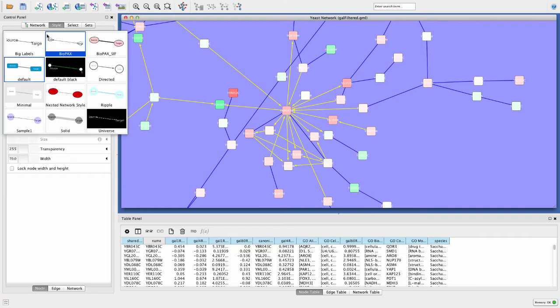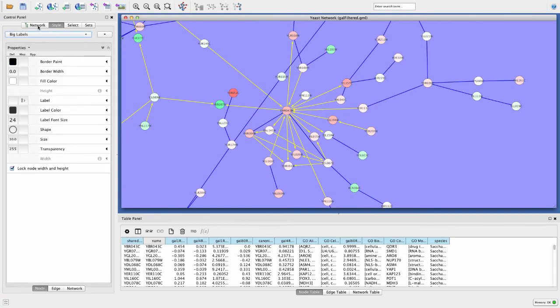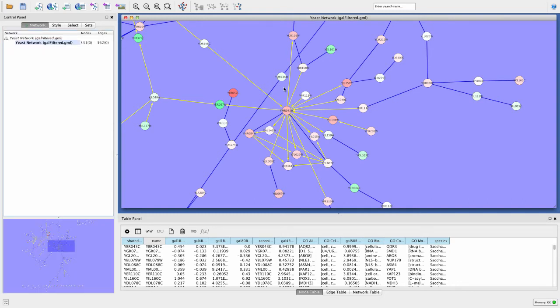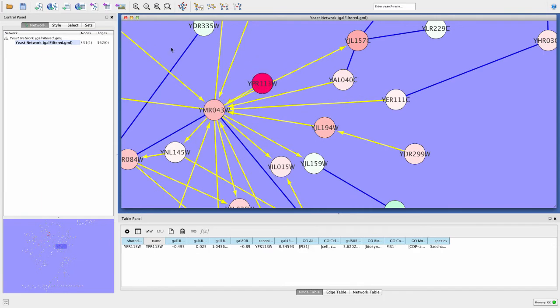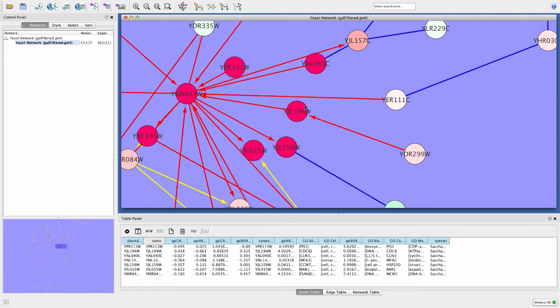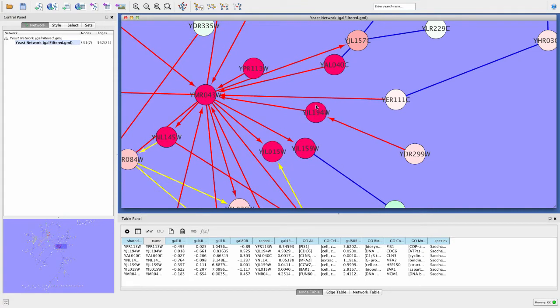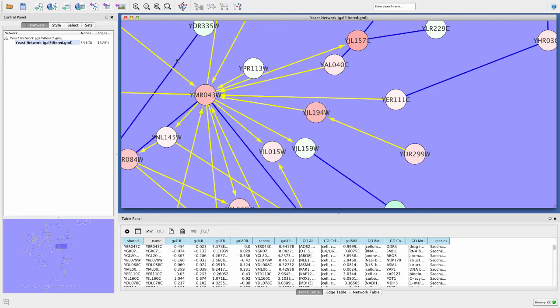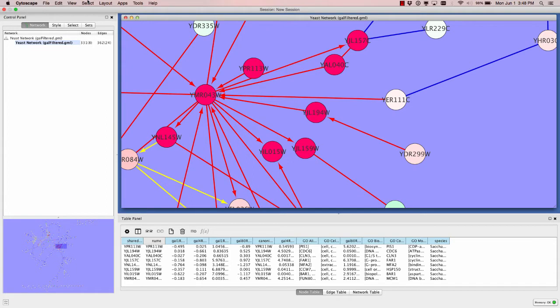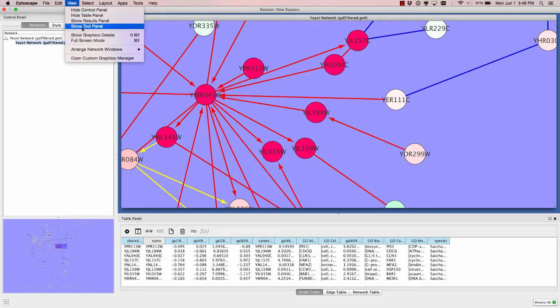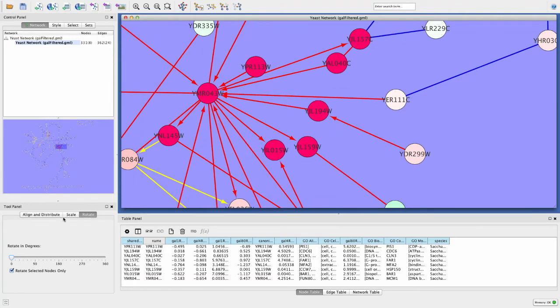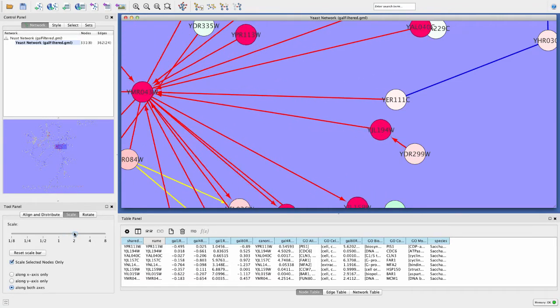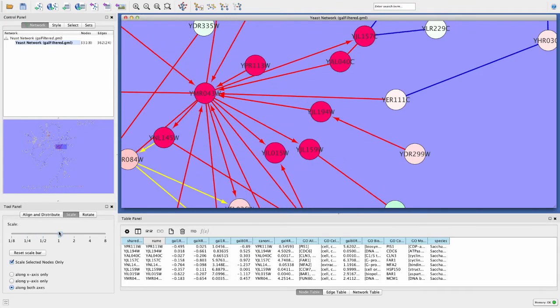I can select some edges and go to the layout menu. I can rotate or scale them - so if nodes are really bunched up, I can use the scale feature to expand them. Usually when you load up data in Cytoscape, you'll see a default grid layout which is not very useful. The first thing you usually want to do is go to the layout menu and apply layouts. One that I like is called Y-Files Organic. You can also have a circular layout or a hierarchical layout - the hierarchical one would work well for gene ontology or a phylogenetic tree.